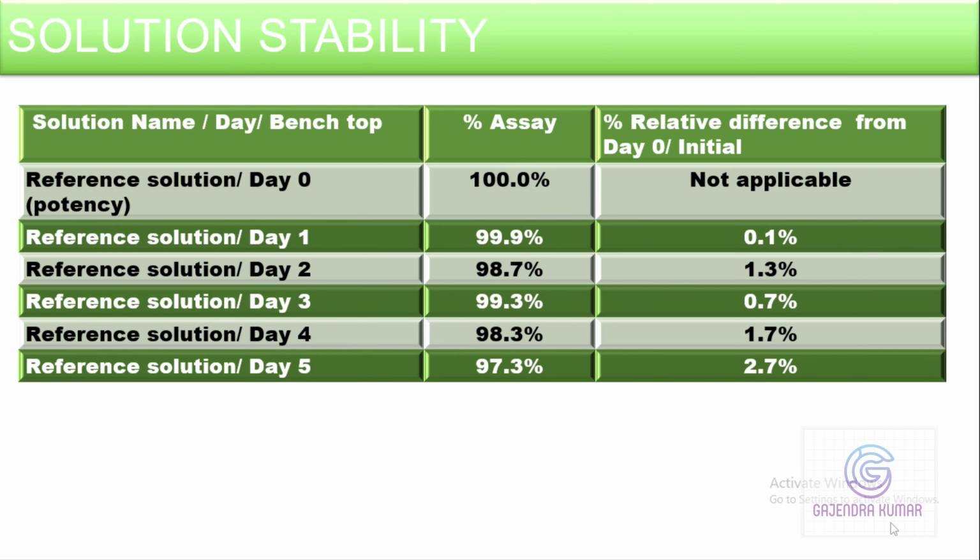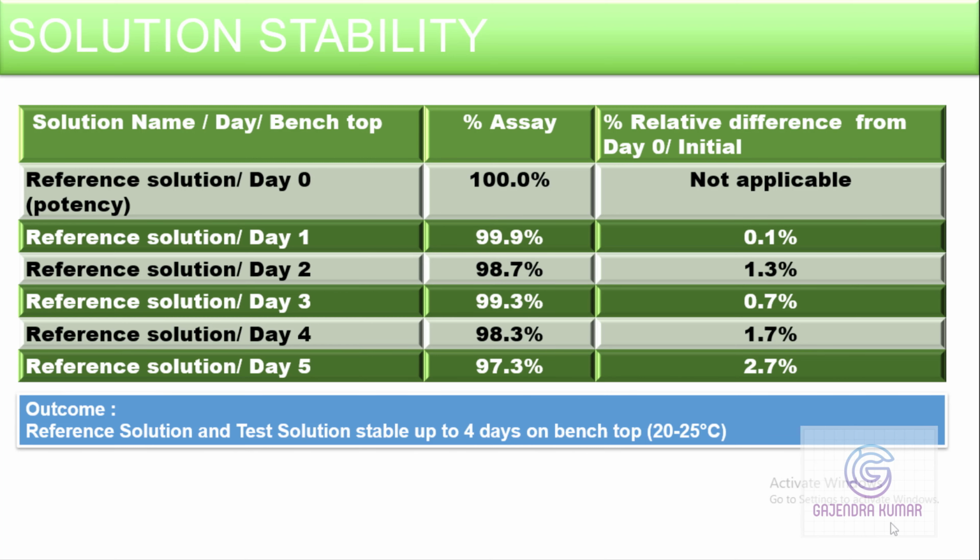So these are the results for the standard solution. It's the same trend as the test solution. So what is the outcome based on these tables? The outcome is the solution is stable up to 4 days on bench top.